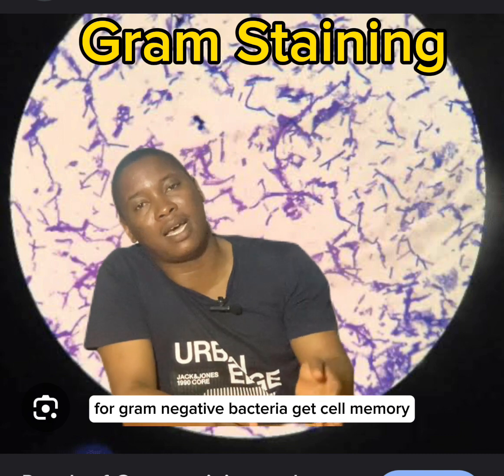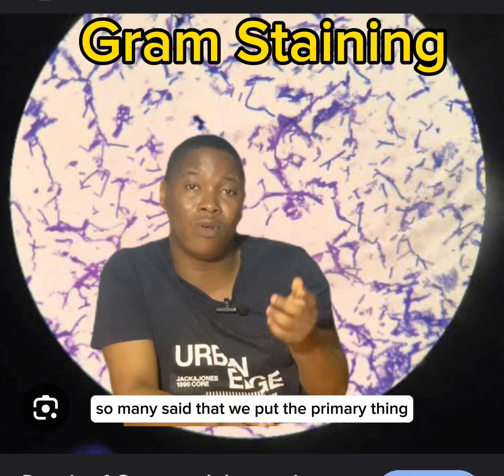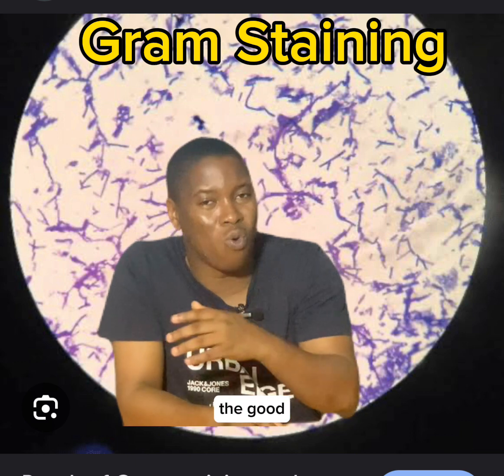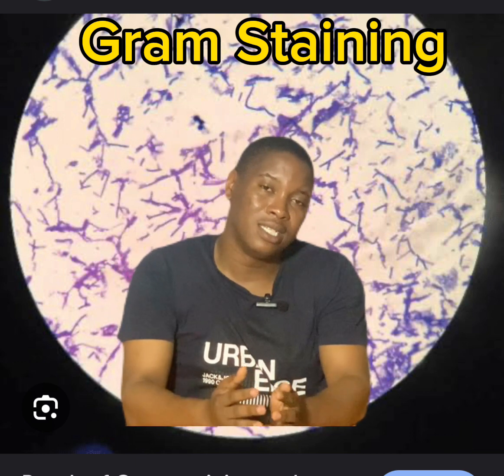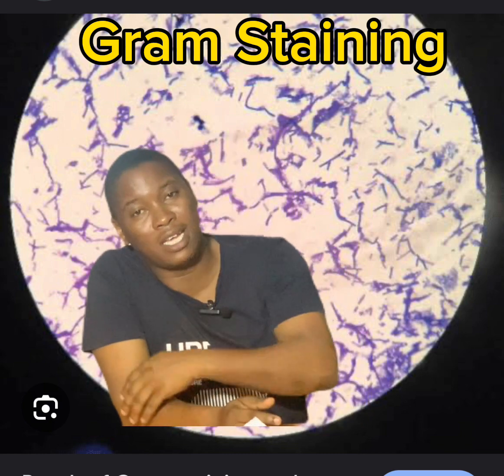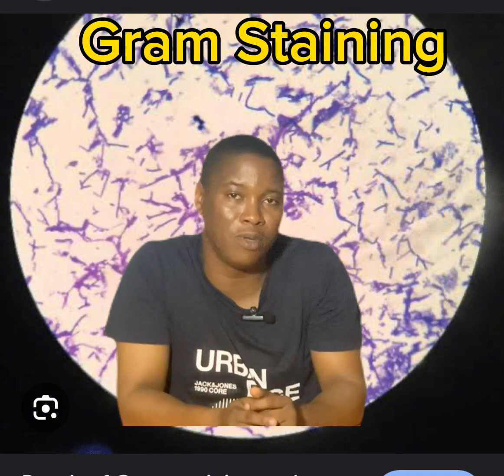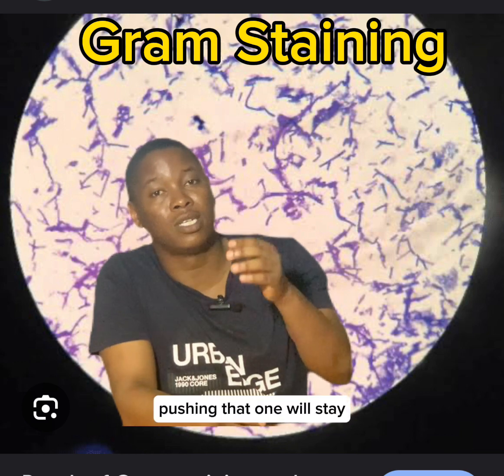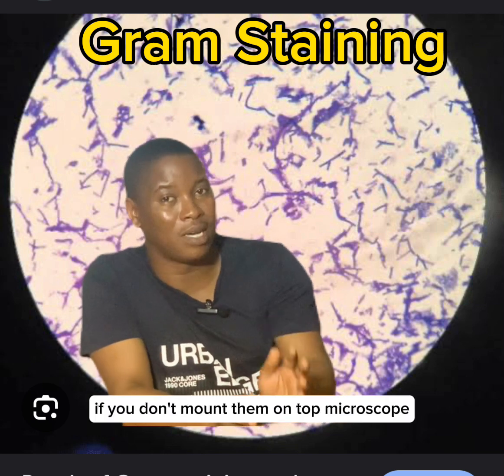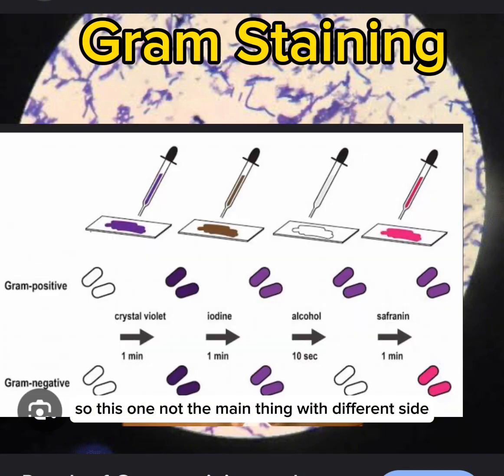But gram negative bacteria get cell wall wey dey thin, very thin. So meaning say the time wey you put the primary stain come put the mordant, they go dey there, but if you come put your ethanol, e go wash away all those things, because the cell wall no dey thick enough to retain that primary stain. So the decolorizer go wash away everything, meaning say the time wey you come put that fourth chemical wey be your safranin, your carbonfuchsin, that one go stay for there. So na that color you go dey see, and all this one na if you mount them on top microscope, you can't dey see all these different colors. So this one na the main thing wey dey for inside gram staining.